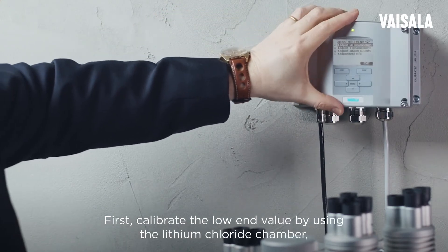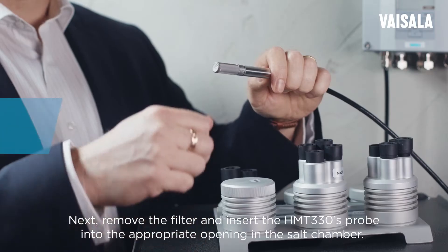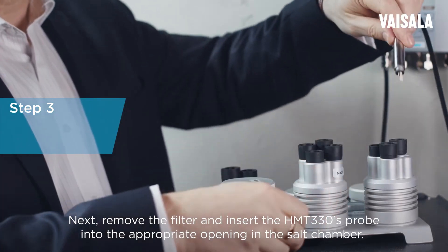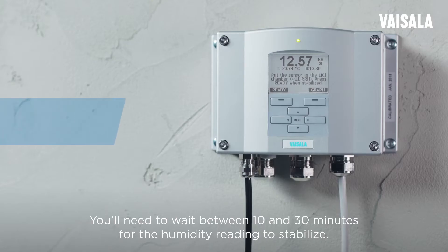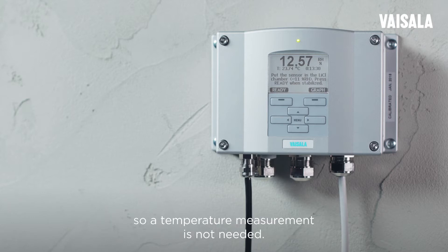Calibrate the low end value by using the lithium chloride chamber, which will give you 11% relative humidity. Remove the filter and insert the HMT-330's probe into the appropriate opening in the salt chamber. You'll need to wait between 10 and 30 minutes for the humidity reading to stabilize. The relative humidity reference value for lithium chloride is always about 11%, so a temperature measurement is not needed.